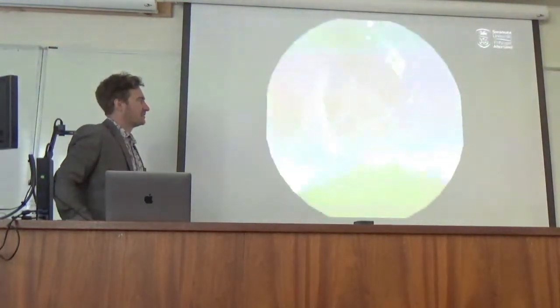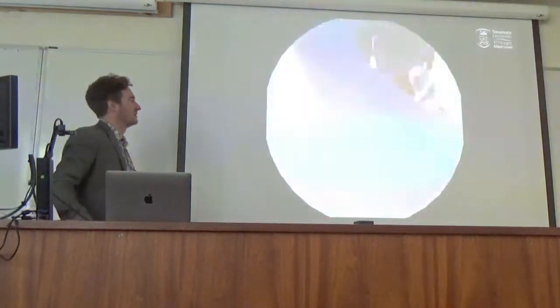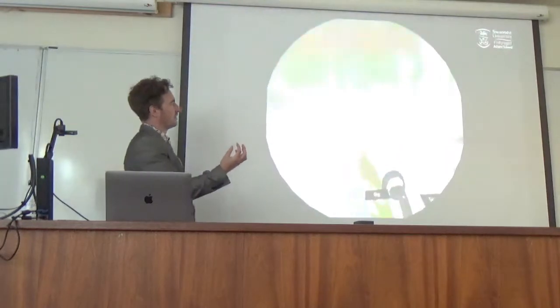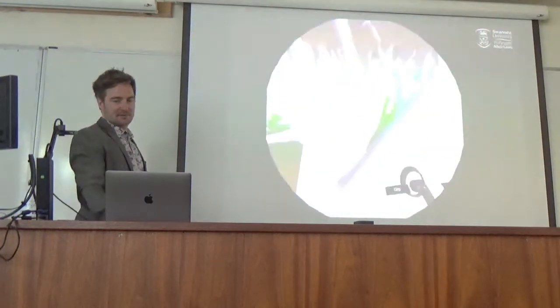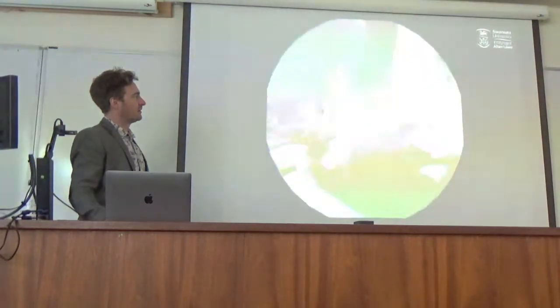If this was the volumetric data, it would look so much better. So this is a simplified surface, but it serves a purpose at the moment until we can find a way of doing volumetric. We're in the mouth parts of the sand dollar at the moment. And once you go in here, it's kind of symmetrical around, so it's hard to find your way out. I think we've been in there long enough.